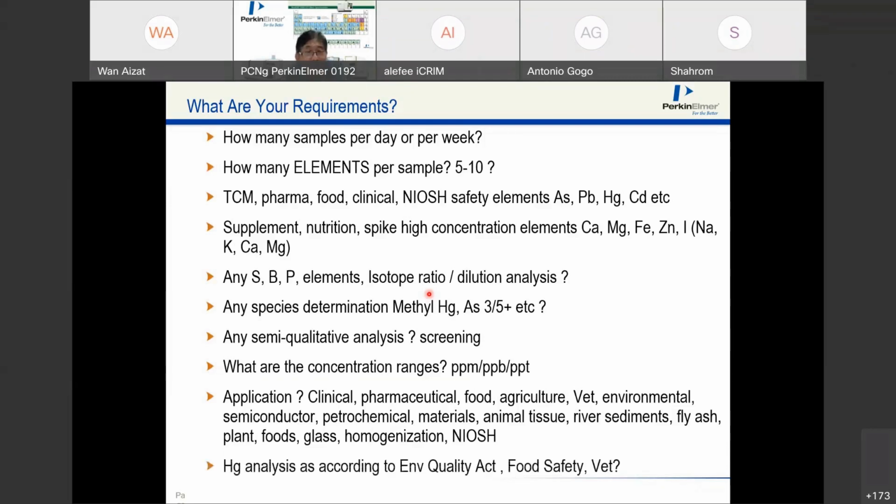So Mercury, if you look into Mercury, is very weird. This method cannot, that method cannot, certain methods include, certain methods exclude. So Mercury in terms of sample prep is also very interesting. Quite tedious, not easy. And in terms of analysis, also very interesting. It tends to exclude a lot of things. If you want to fully follow all this, it costs you a lot of money. Yeah, so that is maybe for information.